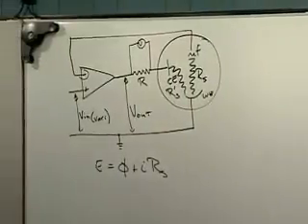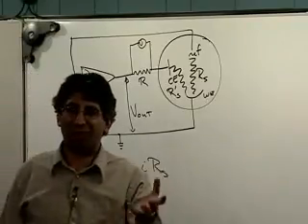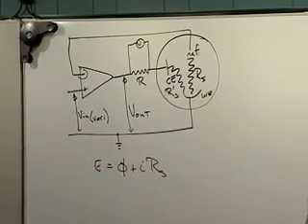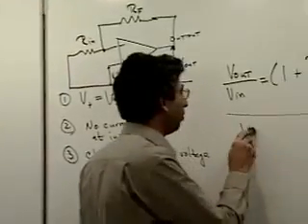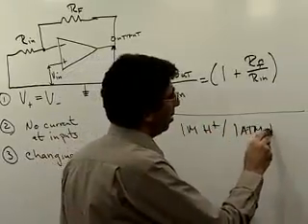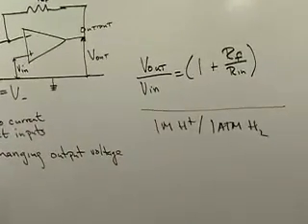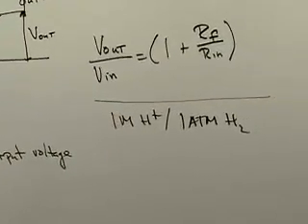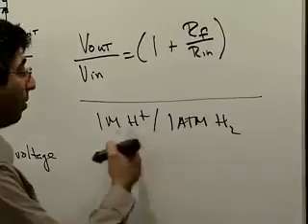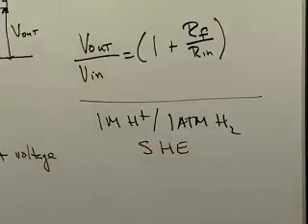Of course, anybody who's opened up a freshman chemistry textbook knows that what you're supposed to use, obviously, because the tables are all like this, is the standard hydrogen electrode. Must be, right? As we are told in our tables that all our potentials are measured against 1 molar protons and 1 atmosphere hydrogen. And we need a catalytic electrode because it's hard to get current to flow there, so we would use, say, platinum, which is a great electrocatalyst, as we've already discussed, for hydrogen. So that would be our standard hydrogen electrode, SHE.